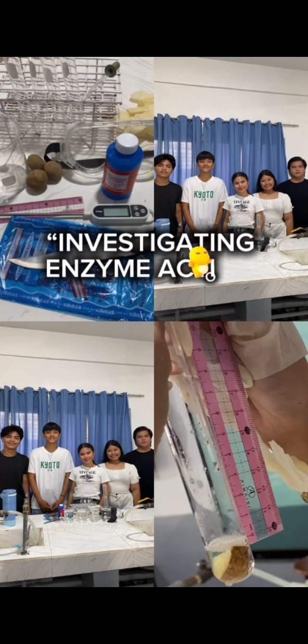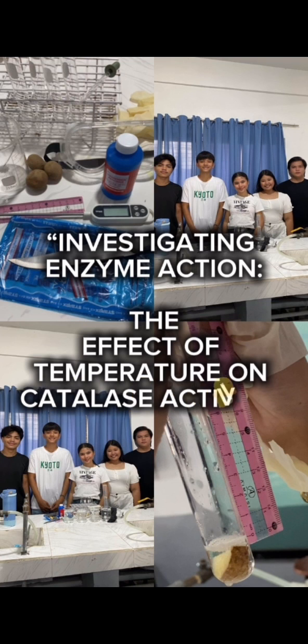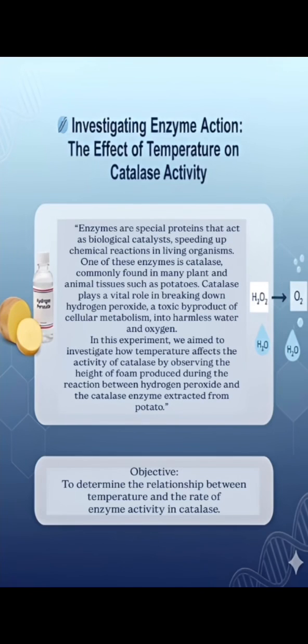Investigating enzyme action: the effect of temperature on catalase activity. Enzymes are special proteins that act as biological catalysts, speeding up chemical reactions in living organisms. One of these enzymes is catalase, commonly found in many plant and animal tissues such as potatoes.